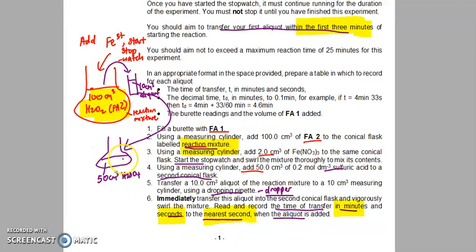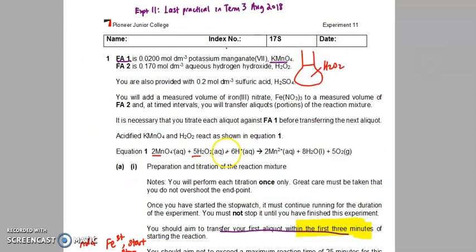Okay, and then you can go on to analyze the concentration of hydrogen peroxide in this reaction mixture at 2.2 minutes by titrating it with manganate, because we know that hydrogen peroxide reacts with manganate in this mole ratio.